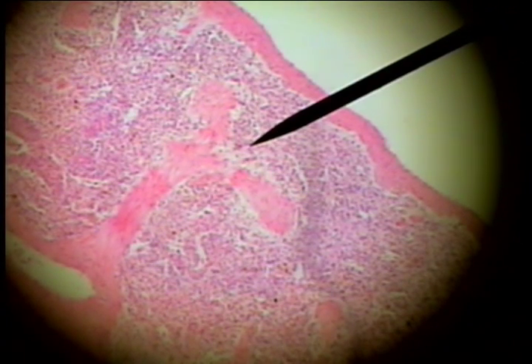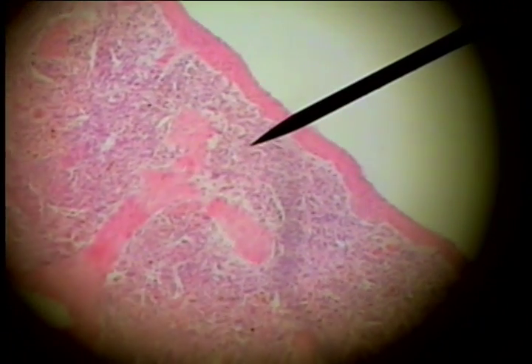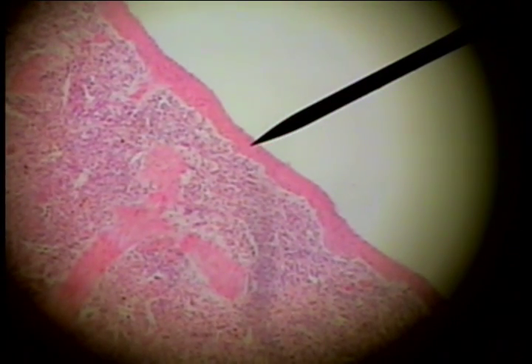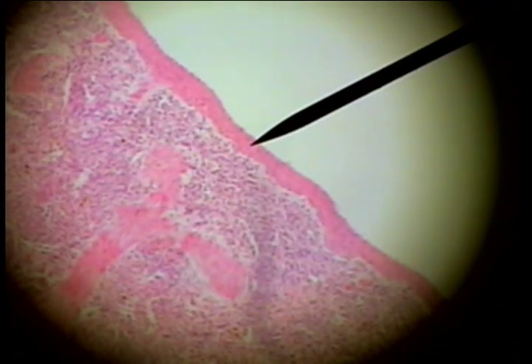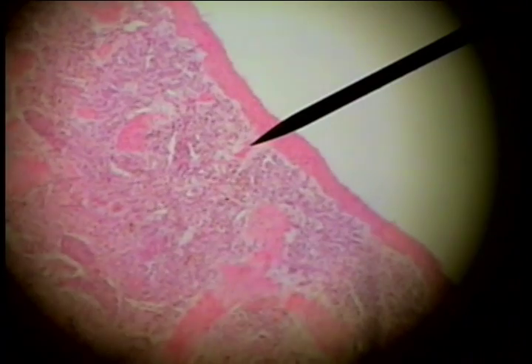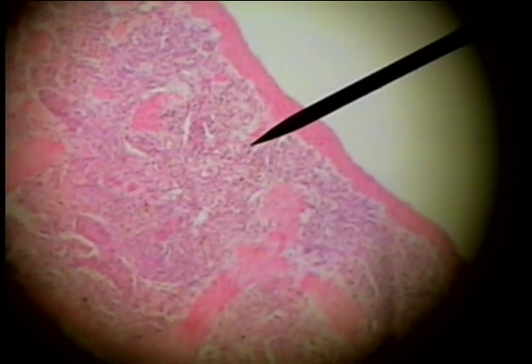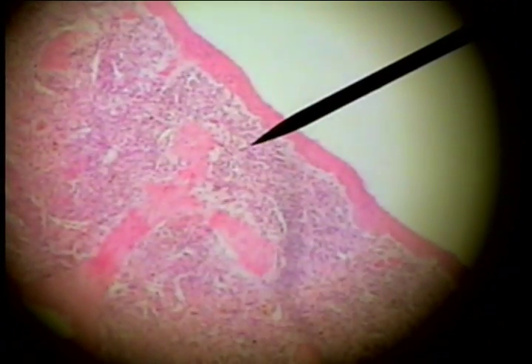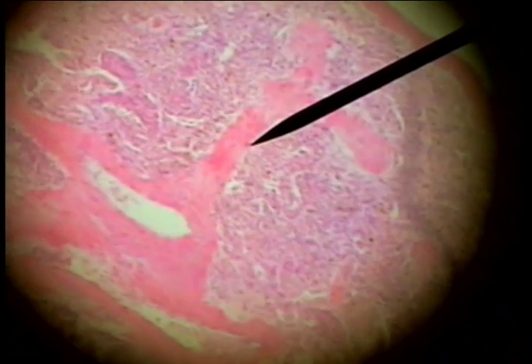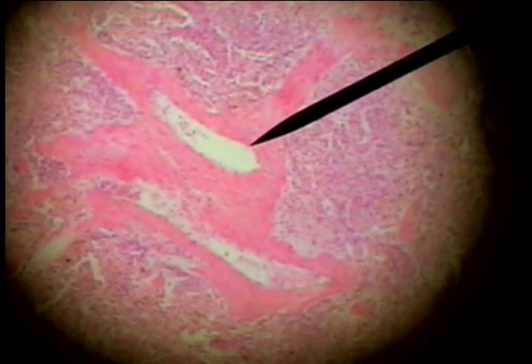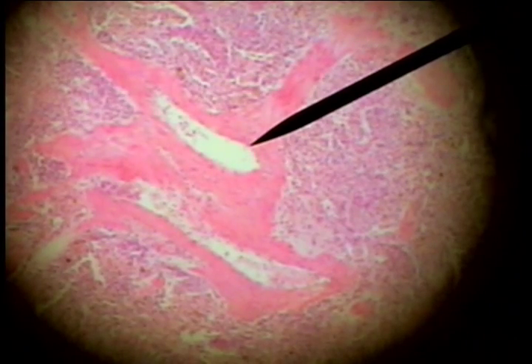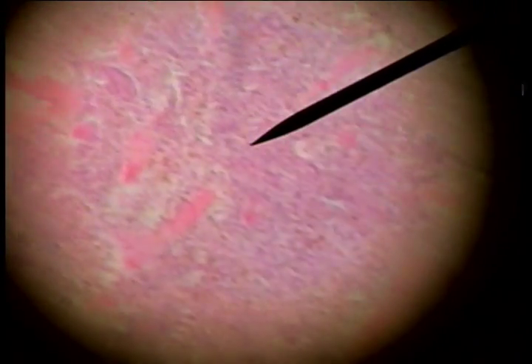This immune tissue is the spleen, and the spleen is characterized by a thick, dense connective tissue outer capsule. This outer capsule extends into and contributes to structures called trabeculae. There are many good-sized blood vessels and arteries found throughout the spleen — it's highly vascular.